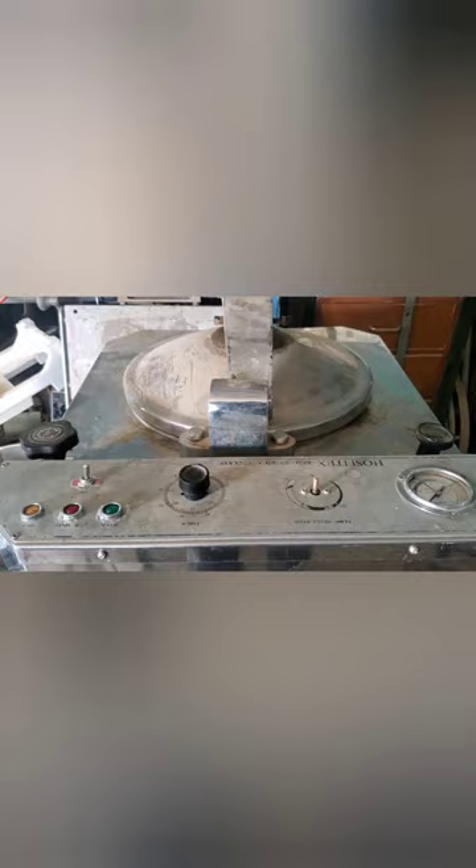This is an autoclave machine. An autoclave machine is equipment used for disinfection, sterilization, and decontamination of biological wastes, medical instruments, and lab wear.